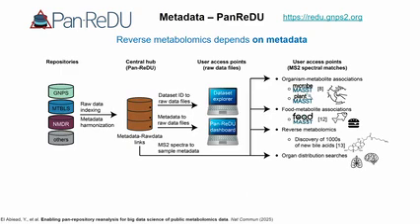Okay, hello everybody. So I'm going to talk a little bit about ReDU, because everything that Vincent was just talking about is basically about taking some MSMS spectrum, searching that against all the public MSMS data that we have out there, which are billions of spectra, and then integrating that with the metadata that we have available for these different sample types. And that, of course, requires metadata. What I'm going to talk about now is how we even get to have this metadata, how we have all this raw data, and also how you are able to contribute to this resource, because that's the only reason this works.